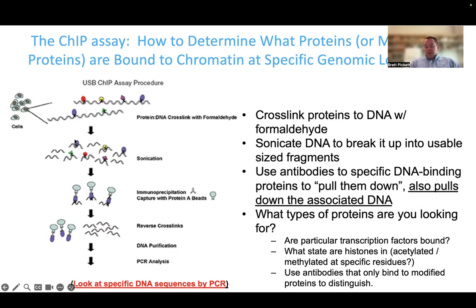All right, now we go into just the immunoprecipitation part with the antibody and the bead that we already talked about. We've already got the proteins stuck to the DNA. So now we add the beads with the antibodies, and the antibodies are going to stick to the proteins that they recognize. That's going to be the purple ovals, and the purple ovals are covalently bound to DNA. So we now have a bead stuck to an antibody, stuck to a protein, stuck to DNA. That's exactly what we want, right? The whole point of this is to find proteins that stick to particular regions in DNA.